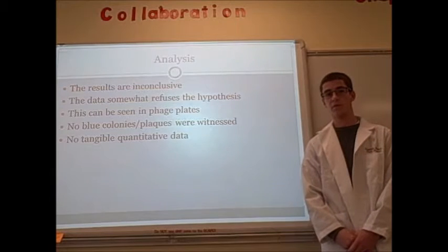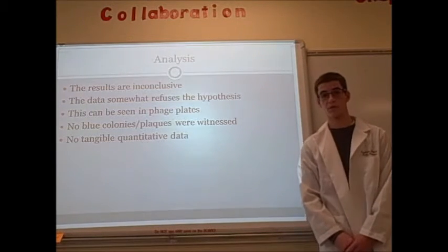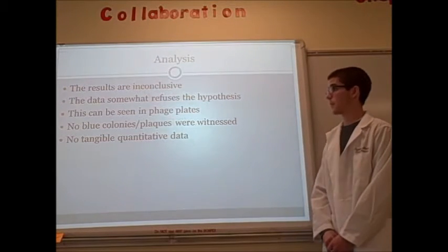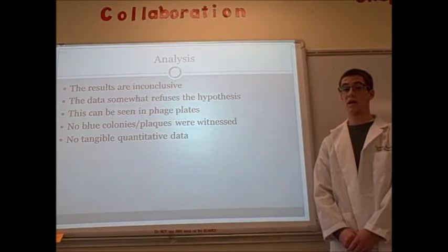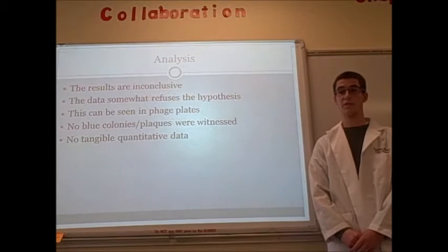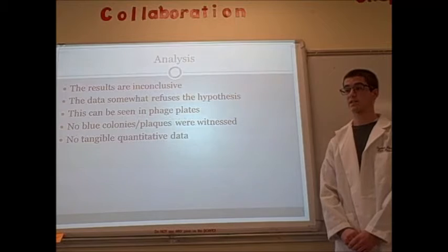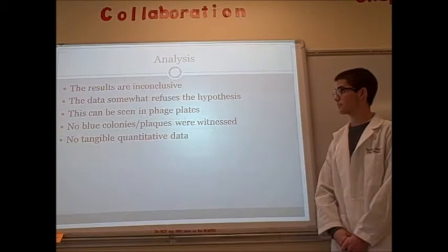So these results are interesting. They're definitely inconclusive because there was no way to successfully quantitatively analyze the results. However, the data does somewhat show and refute my hypothesis because the M13 plate that was transformed with M13 DNA did have some plaques, which definitely indicates that the bacteria was at least transformed.